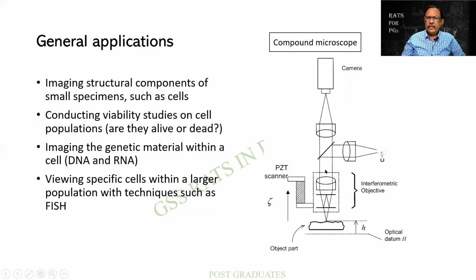There will be a series of objectives, and you find that there is a convergence of light. There will be a prism over here which helps in exact focus of the light, creating a vision in our eyes. And this is the basic principle of it. So this I hope you people will be able to compare with the fluorescent microscope.